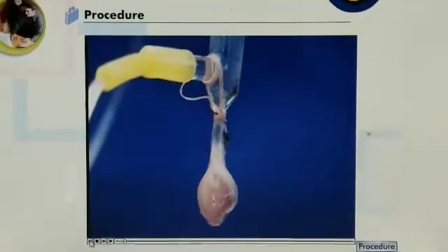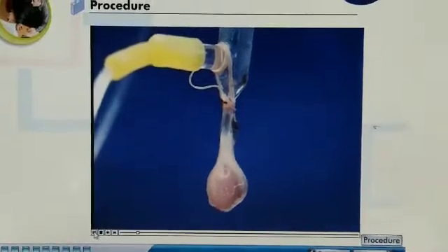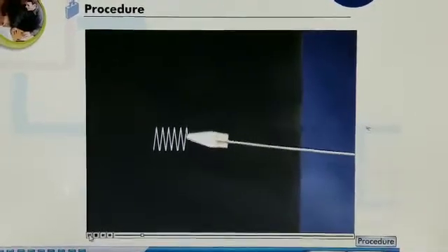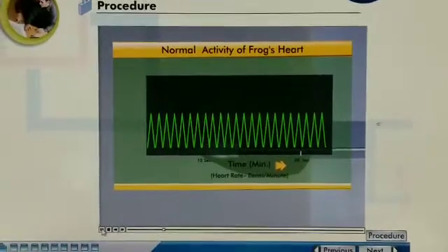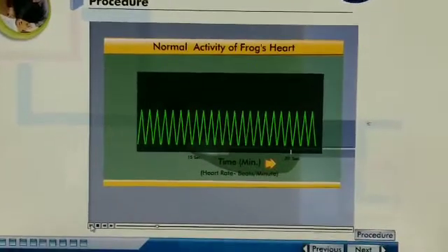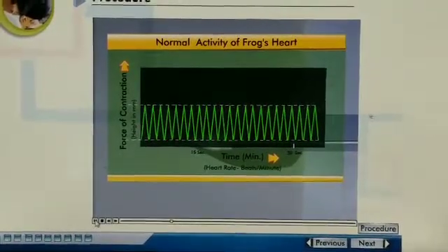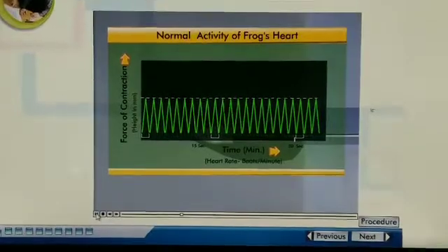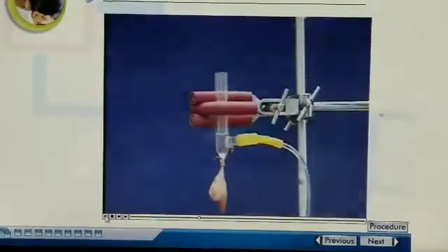For studying the effect of potassium and calcium on frog's heart, perfuse the isolated and mounted frog's heart with frog Ringer's solution. Start the drum and record normal contractions on smoked paper for one minute. The number of pegs per minute indicates rate of contraction, while the height of a single peg indicates force of contraction. All pegs are of the same height and at the same distance, meaning contractions are rhythmic and with normal tone.